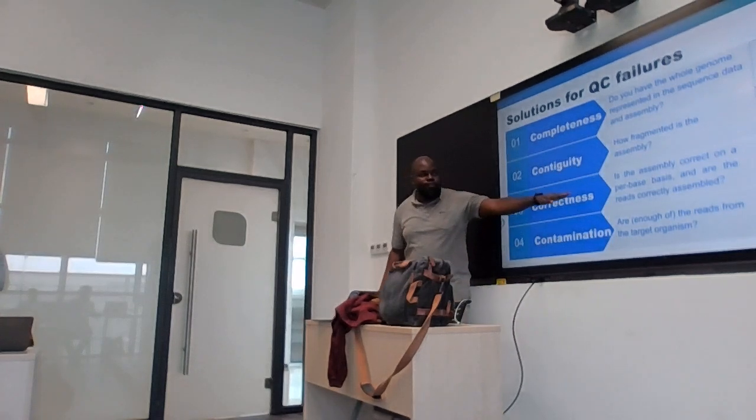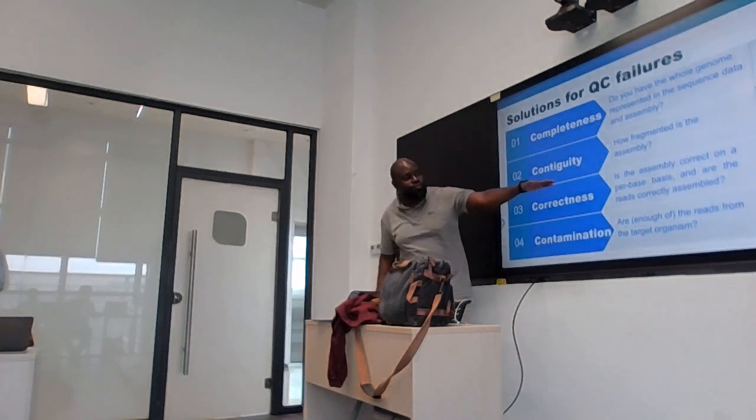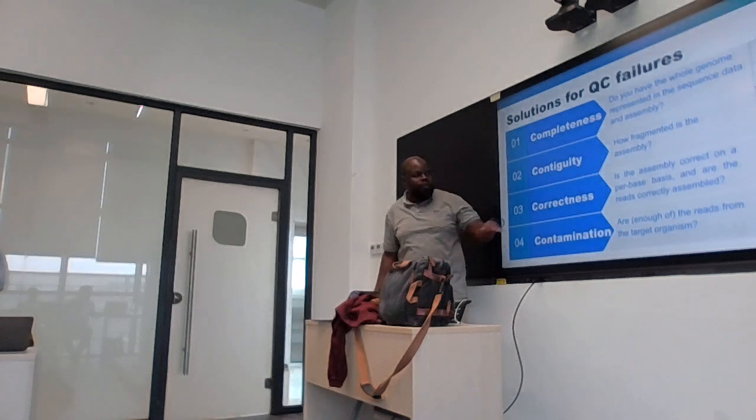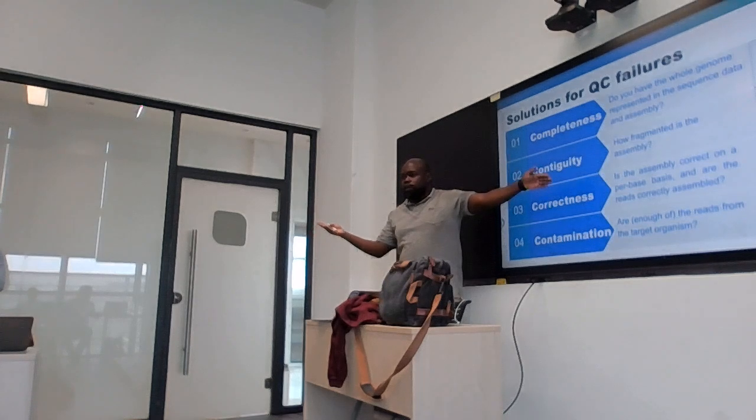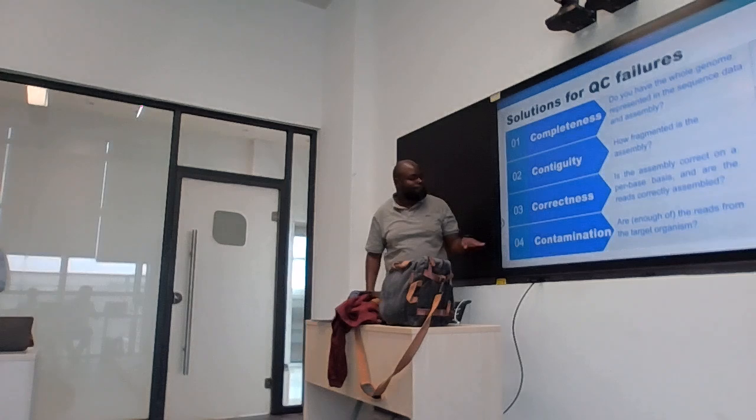Third, you're looking for correctness. So again, if you're having lower quality, you could try sequencing deeper so that you have more confidence in the base calls that you're doing, or even just use higher accuracy sequencing. So for example, if you're using ONT, definitely avoid fast mode and always go for the super accuracy, or worst case scenario, high accuracy, right?